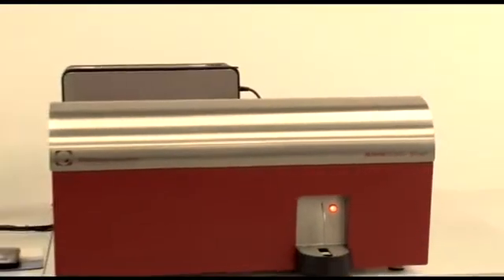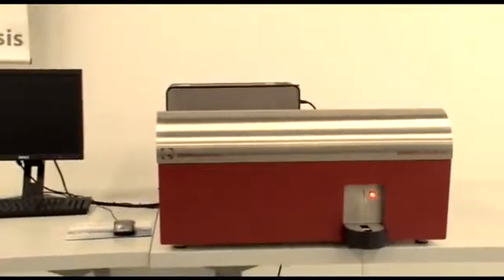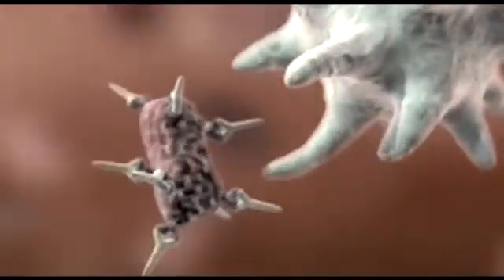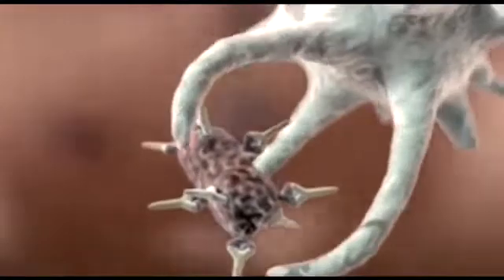Somatic cells are white blood cells or the body's defense mechanism, whose primary functions are to eliminate infections and repair tissue damage. The number of these cells in the milk gives an indication about the health of the cow and the quality of the milk.